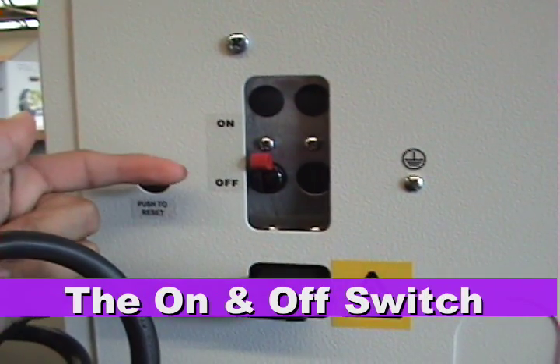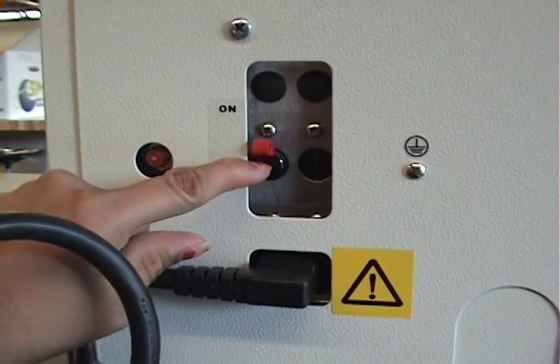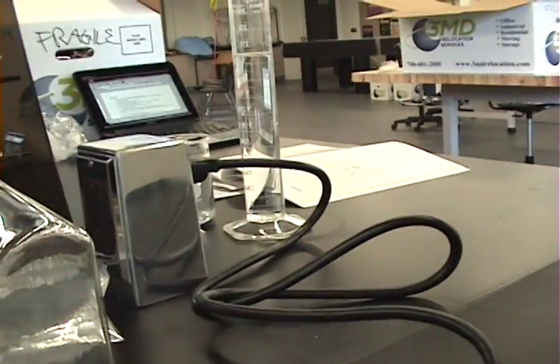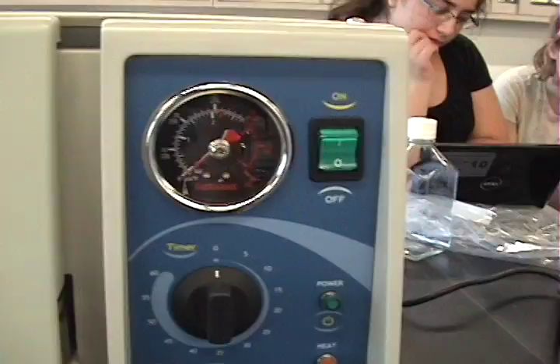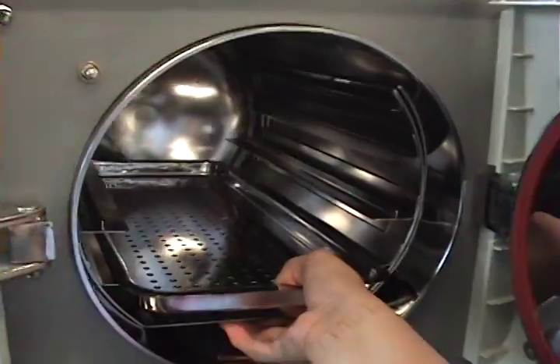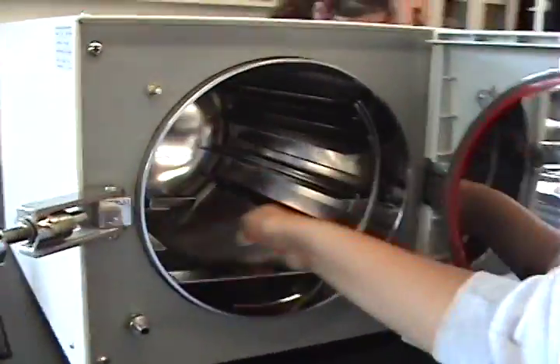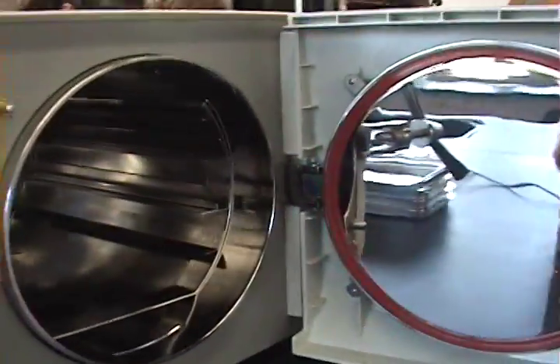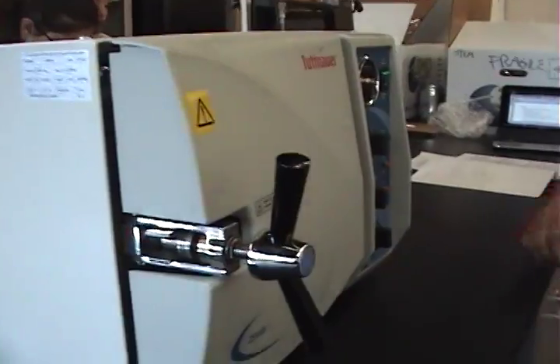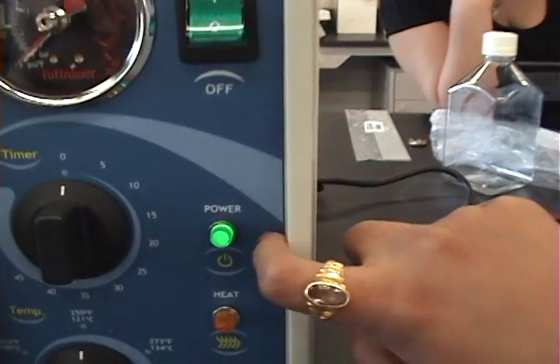Make sure the switch is in the on position and it is plugged into the power outlet. Make sure that the autoclave is emptied out — it should be clean of all residue. Lightly close the door; do not tighten it all the way. Go over to the on button and turn it on. The power light will come on.